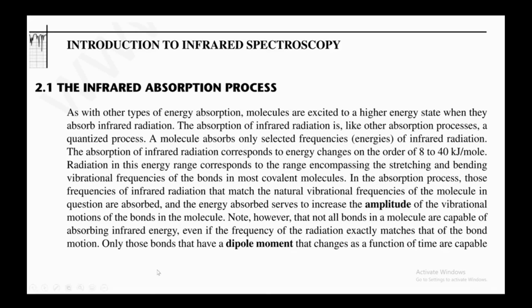Note, however, that not all bonds in a molecule are capable of absorbing infrared energy, even if the frequency of the radiation exactly matches that of the bond motion. Only those bonds that have a dipole moment that changes as a function of time are capable of absorbing infrared radiation. So the principle of IR spectroscopy is dipole moment.